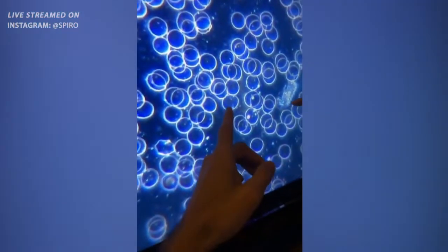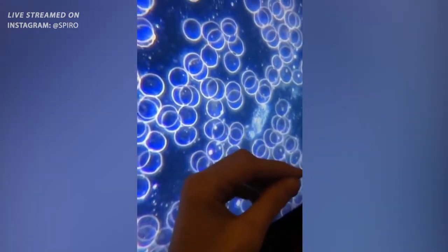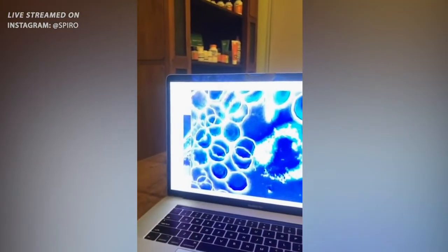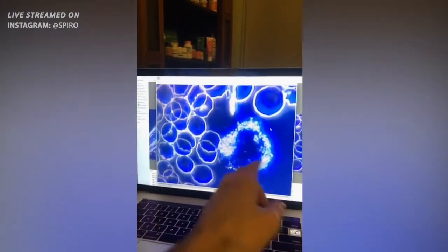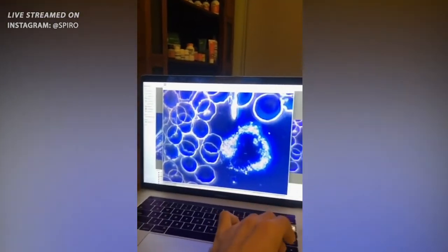Let's look at this live one. This is what blood cells are supposed to look like. A white blood cell, you see the activity, and the membrane is the way it's supposed to be. You can see it's perfectly circular. This is the visual reference for how good blood cells should look. Here we're seeing a totally corrupted cellular membrane. And this here is what, Dr. Peggy? A white blood cell, but it's destroyed. This is a white blood cell that has been totally destroyed in a vaxxed person.